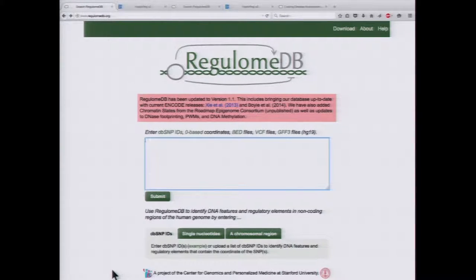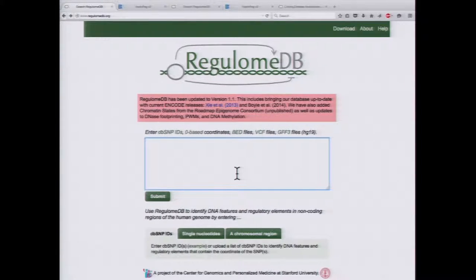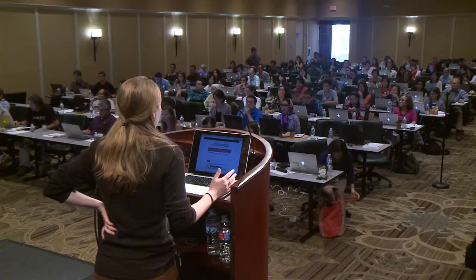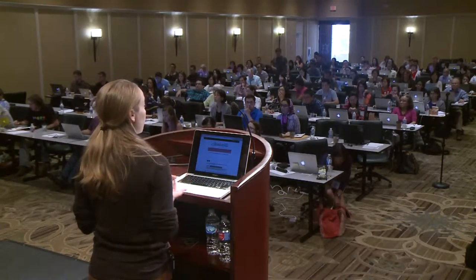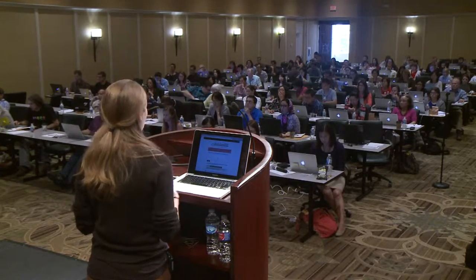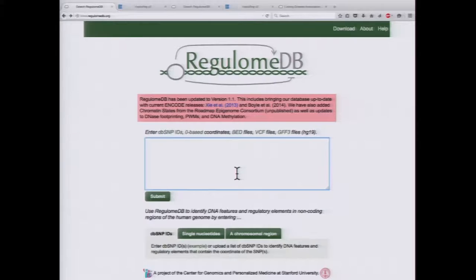If you want to follow along, you can go to regulomedb.org. This is the web page, and you can enter many different types of data to explore different variants. You can enter dbSNP IDs, upload BED files or VCF files, and you can also enter coordinates directly into the box.